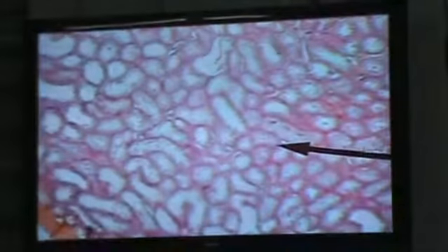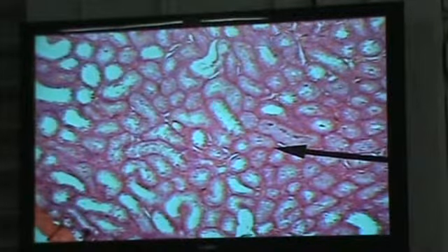Okay, let's look at this one. The ductuli efferentes have just cilia in their walls. Alright, that definitely was leading into, there's a transition going to the duct of the epididymis. Okay. Alright, still this here is epididymis that we're looking at.